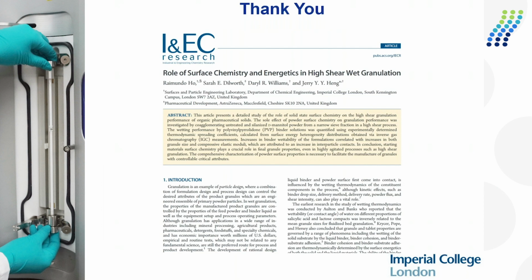There's a question about how the packing density affects the IGC measurements. The answer is it doesn't affect them at all. In the IGC experiment, the packing of the column is factored out. The methane injection we do at the start factors out any impact of column packing. So there's no issue around how well we pack the column or not.